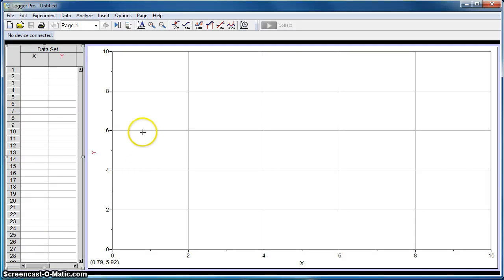Alright, welcome to a screencast of how do I use LoggerPro, a basic edition. In this screencast, I'm going to show you the very basics of LoggerPro, including labeling the data table and axes of a graph, labeling the graph itself, scaling the graph, and there's a few different ways to do that. There's an auto scale feature, and you can manually scale it, and then also best fit analysis stuff, which we've perhaps done already. So let's get started.